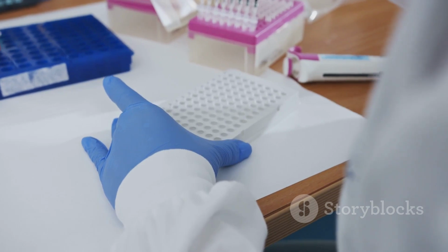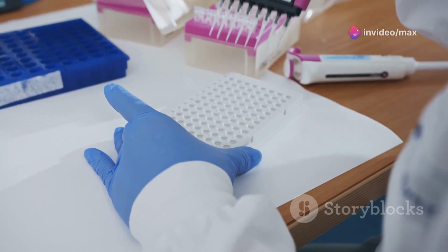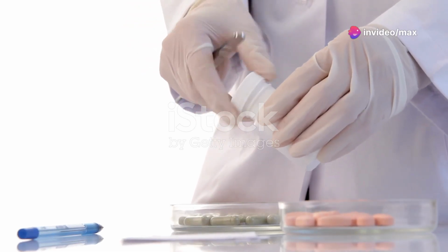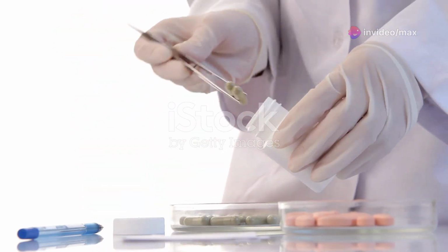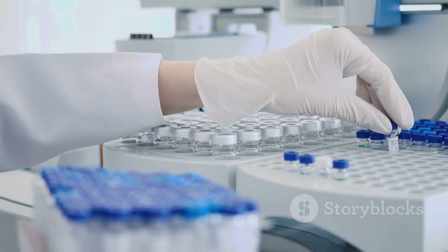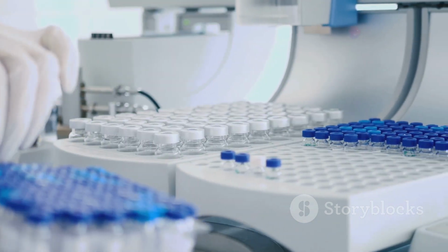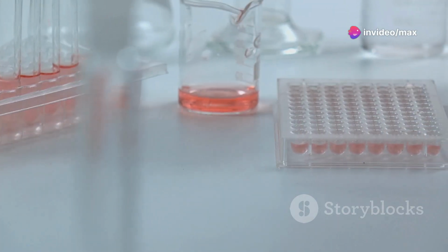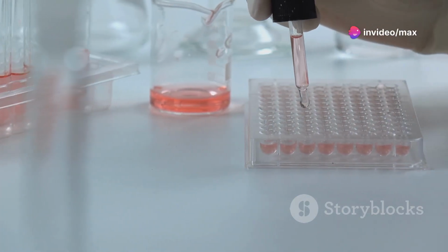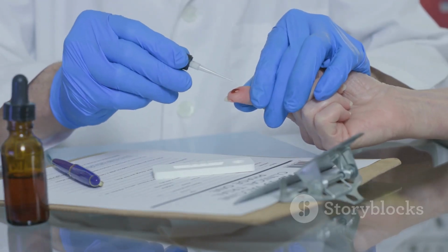Now, let's step up our ELISA game with the indirect ELISA. This method takes a slightly more roundabout, but ultimately more sensitive approach. Like direct ELISA, indirect ELISA starts with the antigen immobilized on a surface. The patient's serum is added, and any antibodies specific to the antigen will bind. Here's where it gets interesting.